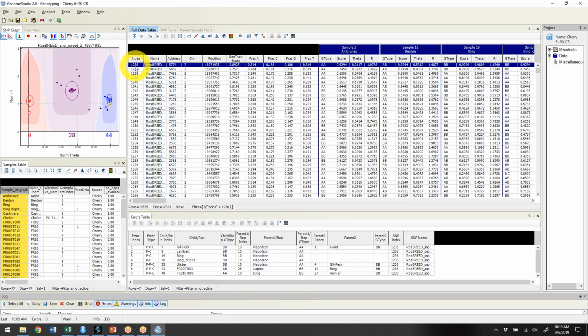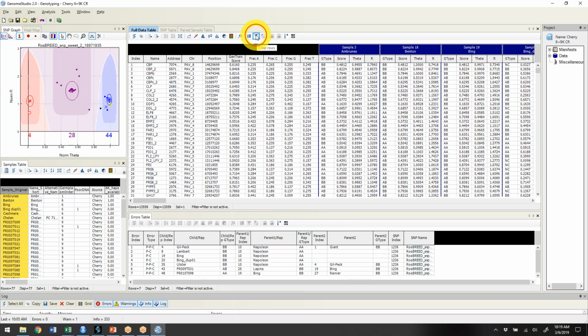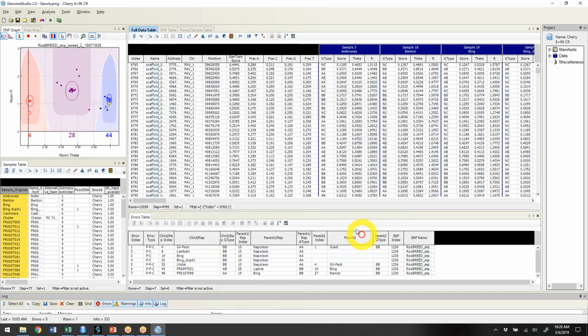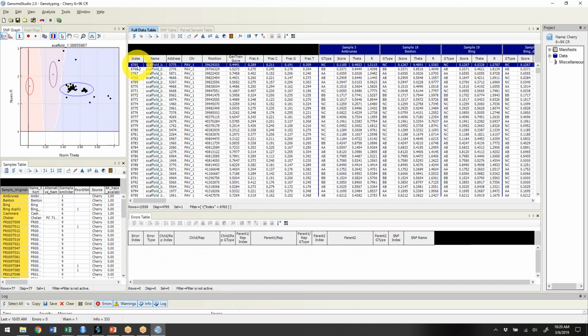The very SNP that appears at the top is this SNP that I was looking for. Now if I remove the filtering again and I want to look for a different SNP, you can see that the not remains checked. So that's one of the only things that doesn't reset every time. So from now on, I can just type in any number I want as a filter criteria, and I can really quickly go to the SNP I want. That definitely has saved me time.